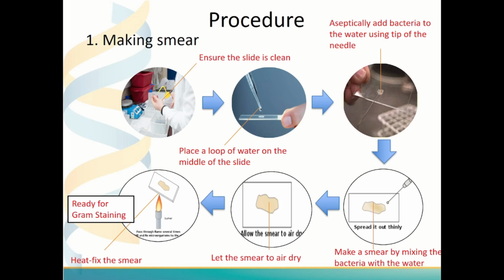And then we can heat fix the smear by moving the slide two to three times through an open flame. Please avoid overheating. Use a pair of tweezers if you can't stand the heat. Okay, and then now the sample is ready for gram staining. I hope this procedure is quite clear to you for the first step.